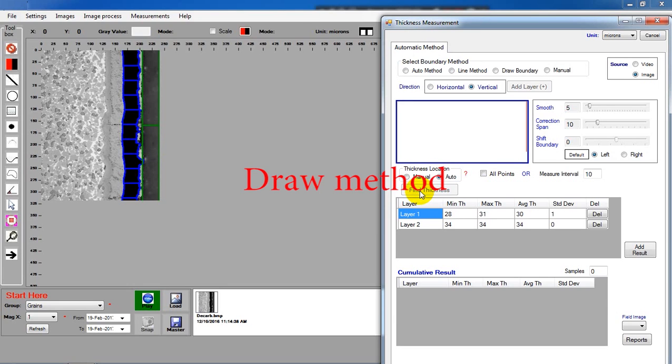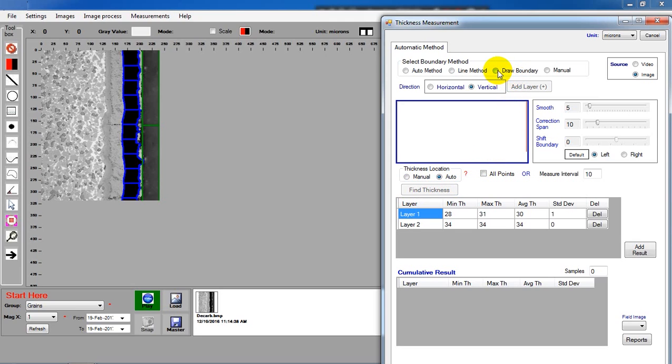Draw method. In this method, you need to draw two boundaries by yourself.